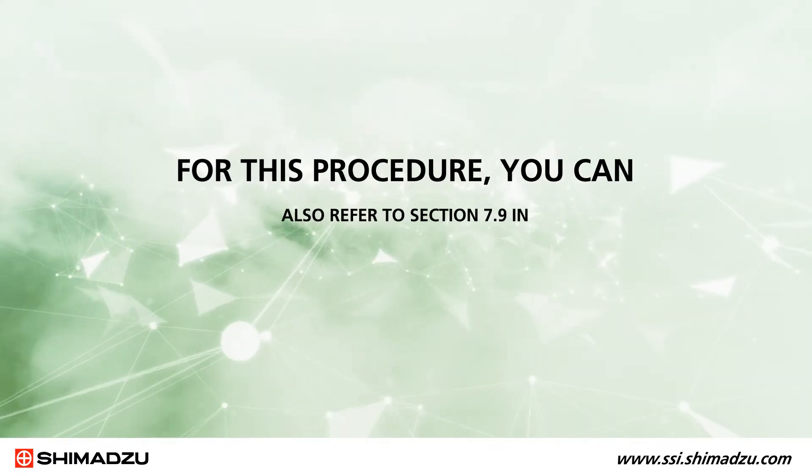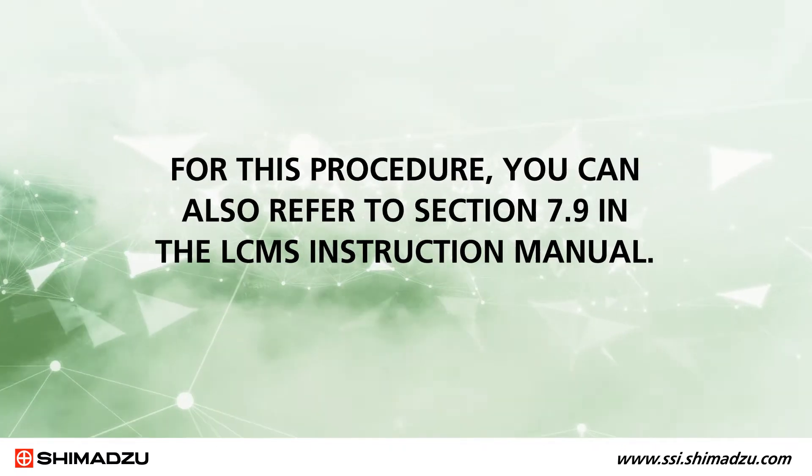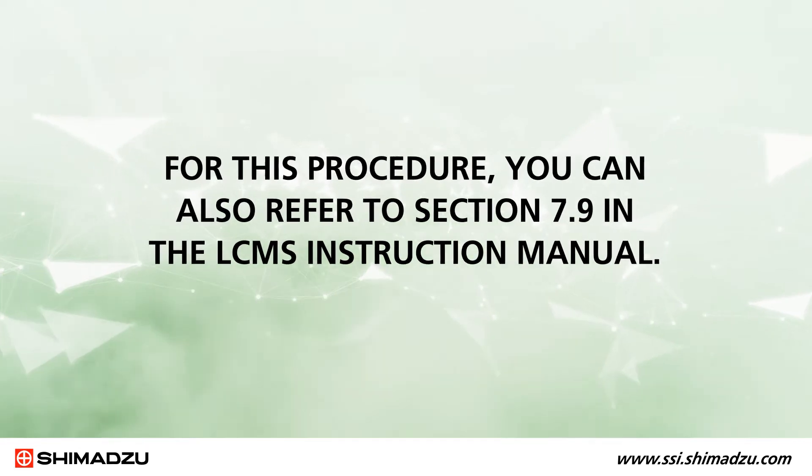You'll see that it is not necessary to vent the instrument in order to accomplish this procedure. For this procedure, you can also refer to section 7.9 in the LC-MS instruction manual.